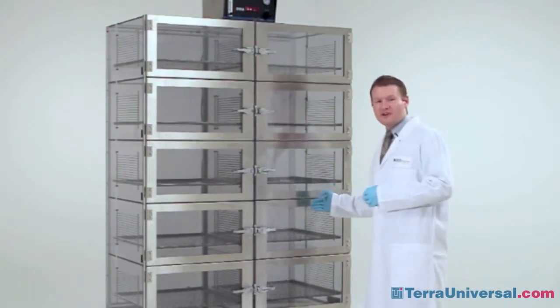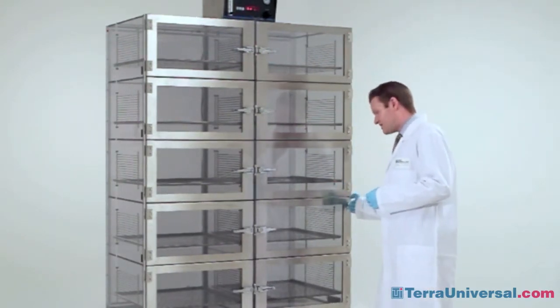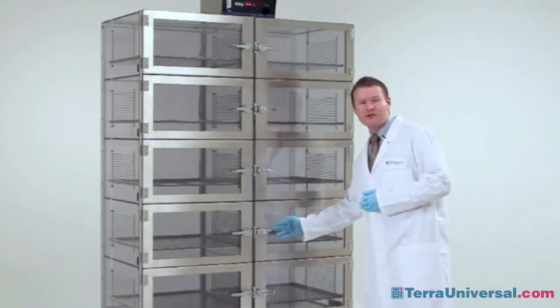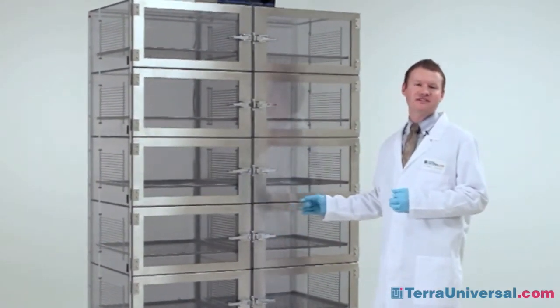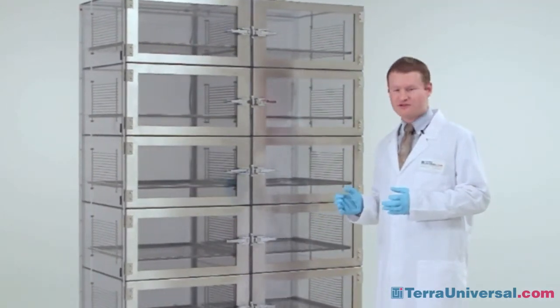Terra Universal's door frames, door hinges, and door latches are all composed of 304 grade stainless steel rather than the industry standard chrome plated steel, which is prone to corrosion.